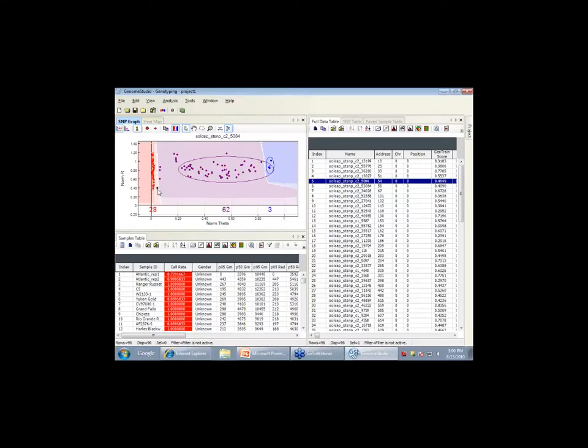using some Excel macros that we've developed. So right now, just assume you're working with diploids, because that's all we can call at this point using the current Illumina software. But within a few months, they hope to have a polyploid module for this. We provided them with this very data set, and they're going to work with that to make those calls.